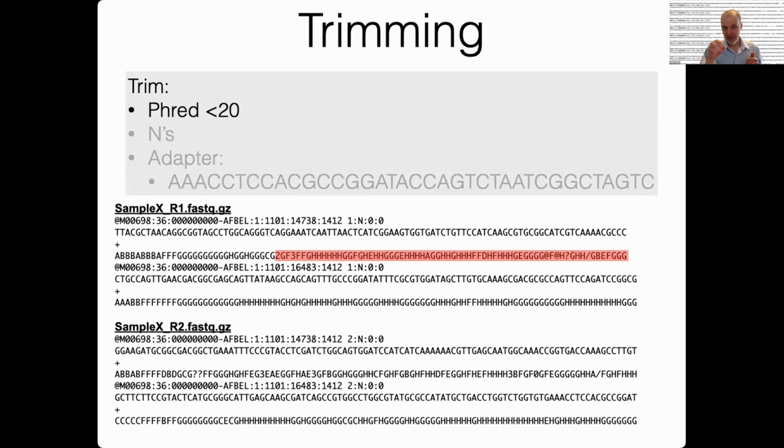what you'd consider a frame shift mutation, or a deletion mutation, a single base deletion mutation. Right? That's not the sequence that we observed if we take out this A and shift everything over. So it's considered more reasonable just to take out this base and everything 3' of it. So that is what we're going to do.